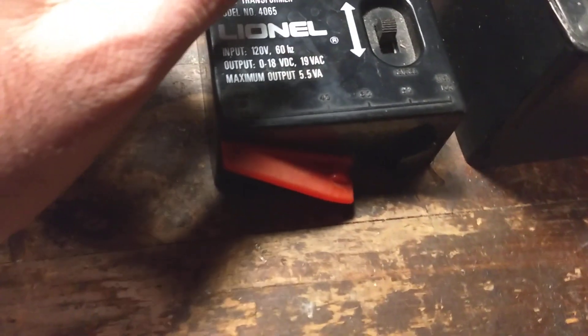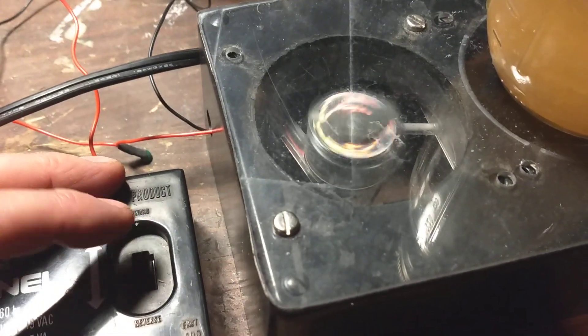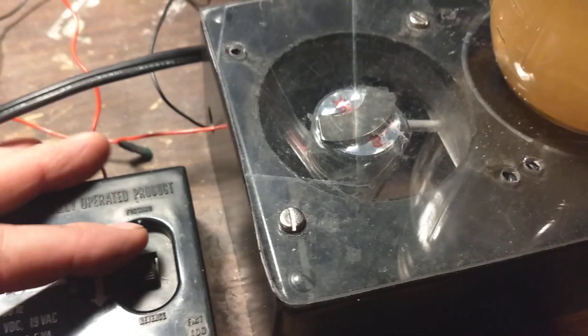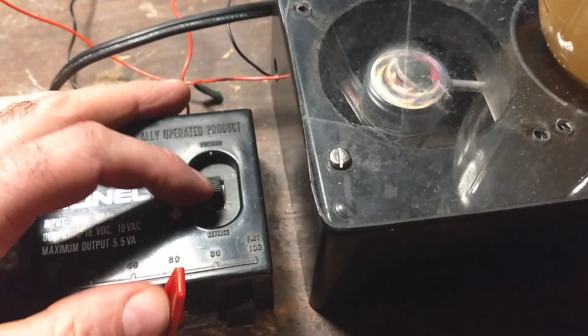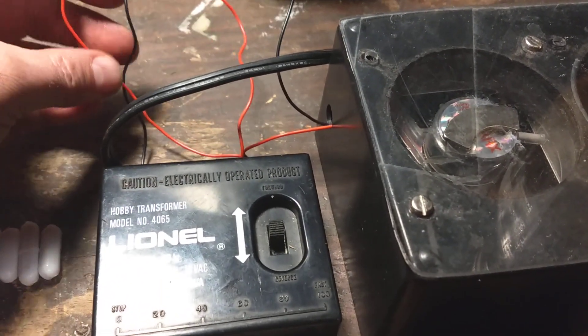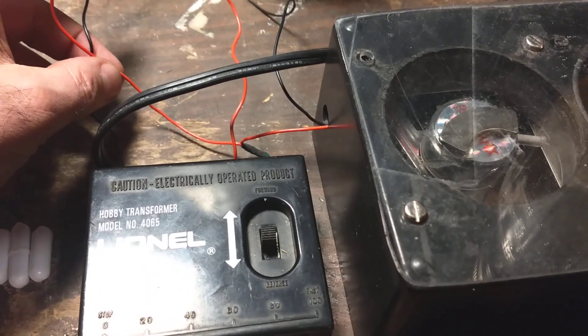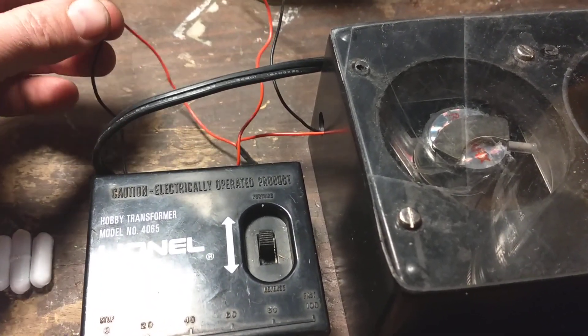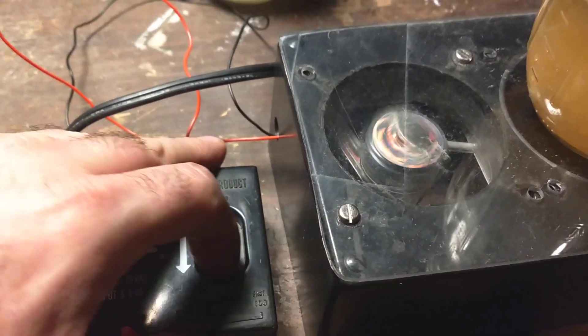Testing it, mine only works in one direction, so if I switch the direction it doesn't work. Sometimes these computer fans have three wires coming out. If they have a black wire, a red wire, and another color wire, usually that other color wire is a sensor. You can just hook the black wire and the red wire up to your negative and positive and see if it spins in either direction.